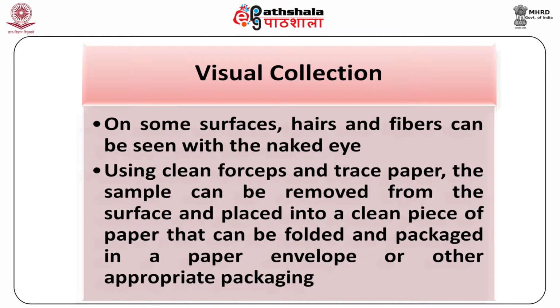For visual collection, on some of the surfaces, hair and fiber can be seen with the naked eye.